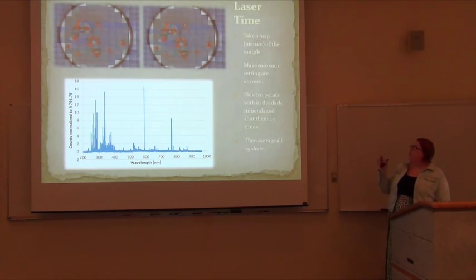So you take the picture, you make sure all your settings are correct, and then I'm going to use this spot for my example. You pick from the dark minerals, because that's what we're looking at, and you shoot it with kind of a clear shot, and it gets all the debris and everything you do not want in your analysis, and then you shoot it 25 times. After it's shot 25 times, it averages all 25 shots into your spectral analysis.